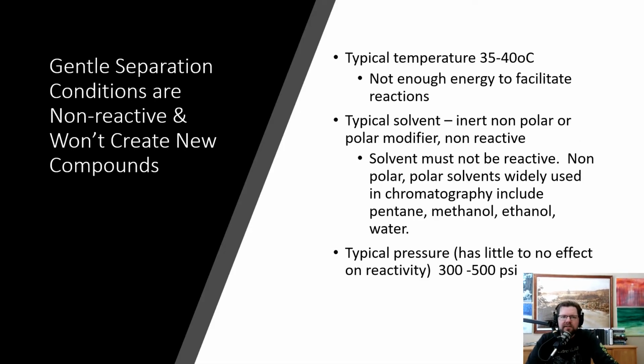So separations are also very gentle. They are not using high temperatures in the column to do the separation. So what happens is, as you add the oil to the column, it's non-reactive and it won't create new compounds and it won't create unknowns. So typical temperatures are 35 to 40 degrees. It's not enough to facilitate reactions.